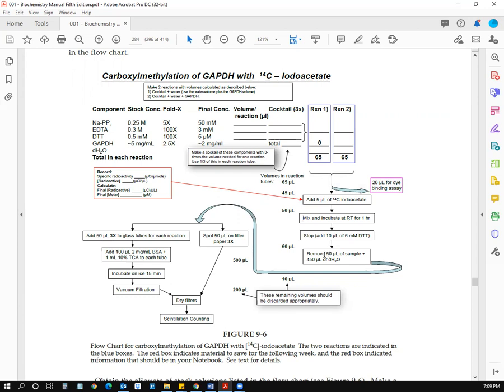And then from there, you only used 50 microliters of this 60 microliter stopped reaction, and then diluted it further tenfold and used a tenth of that for your spotting and your TCA precipitation, from the diluted 500 microliters that you had here. Only a tenth of that reaction was used to make 3 TCA precipitation reactions and 3 direct spots.